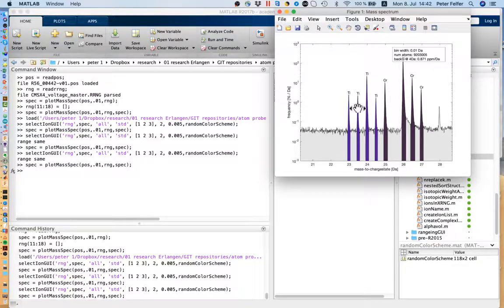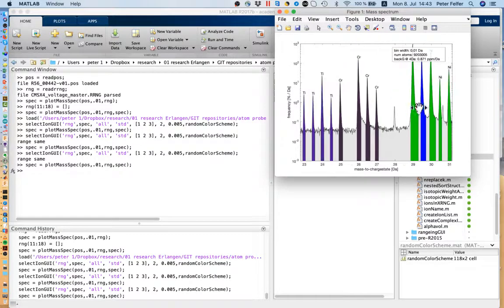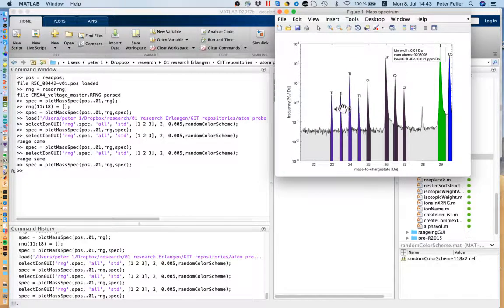Okay, so this is actually hopefully going to make everyone's life with ranging a whole lot easier, because it gives you an educated guess of what the ranges are and makes the range assignment a whole lot faster. I hope I'm going to get to fixing the bugs in the not too distant future, but anyway, it works for now, and so yeah, have fun.